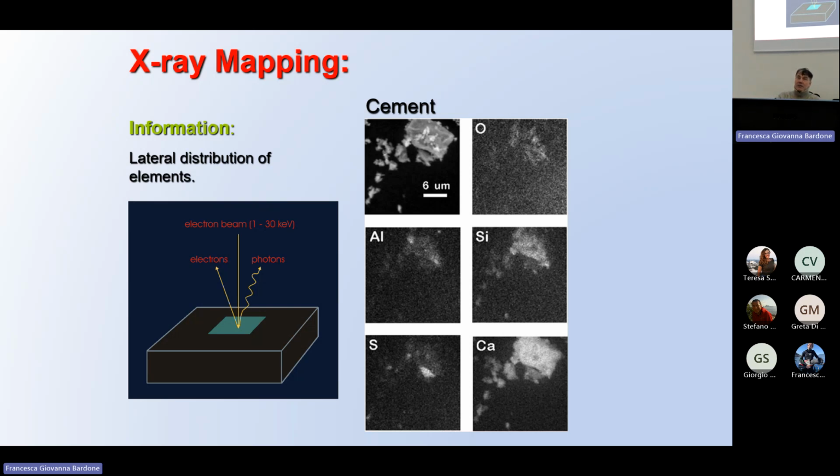For this reason, in the environmental SEM, we don't want any coating at all. So, a high source, a higher number of electrons in small probes, and no coating, even keeping the water inside.